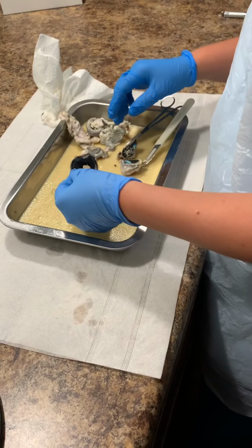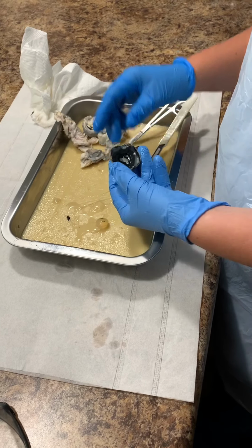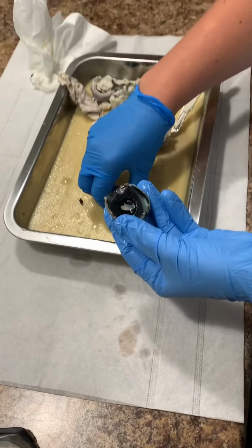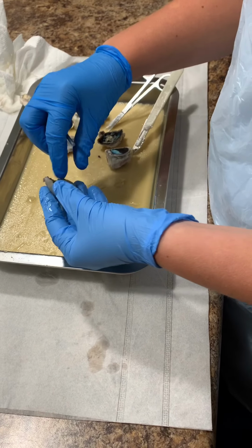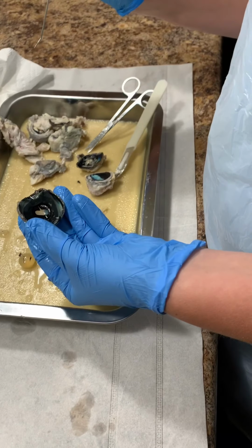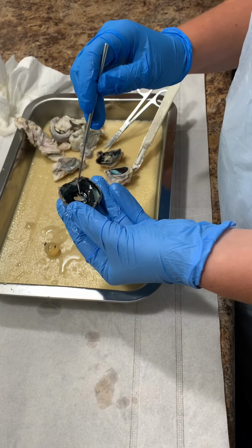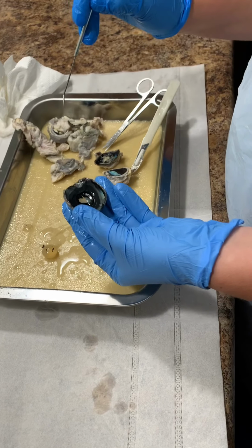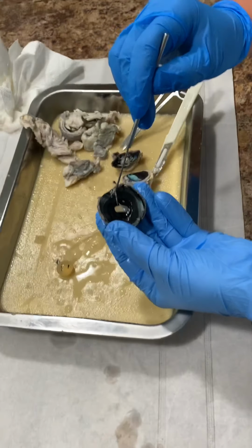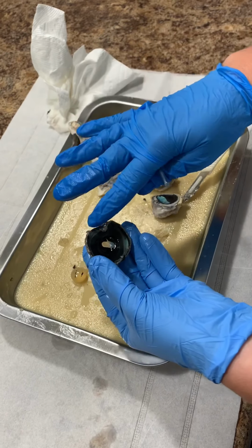Okay, so now I've got the eye cut open, and I accidentally messed up a little bit. But the area where the lens sits, so if we put the lens in, the area where it sits is going to be the anterior chamber. The pupil is the opening in the iris, so that's going to be right in there. The iris is the non-striated black area in here in front of the lens. So it sits right in front of the lens. So the lens sits on top of it.